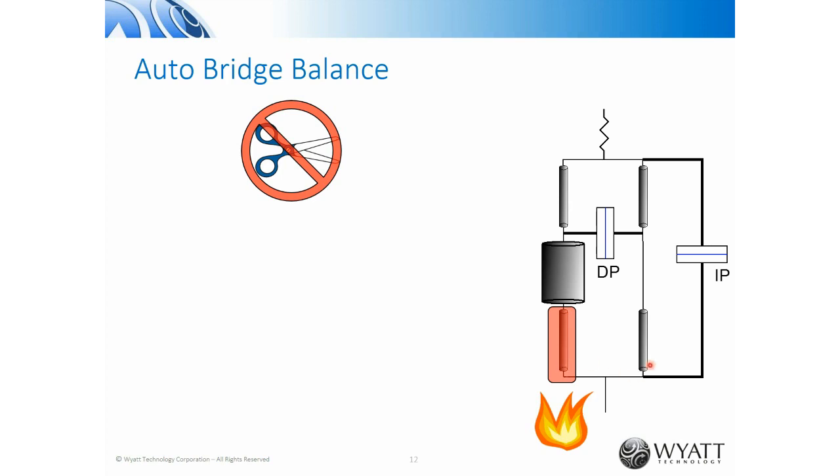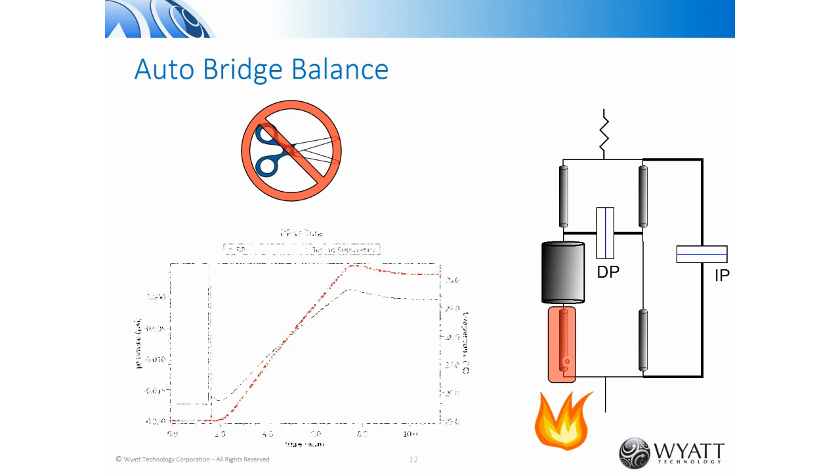And by adjusting this set point relative to these 3, we can automatically balance the bridge at any time by just pushing a button. And the nice thing about putting the thermal adjustment in this arm is that during the run, it only sees pure solvent coming through here. The sample does eventually go through here after the run is over, but during the run, you only have pure solvent. So if you increase the temperature of this arm by 1 degree relative to this, it reduces the viscosity of the solvent in this arm by 2%, and therefore it's the same as making this capillary effectively 2% shorter. So by adjusting temperature, you can effectively change its length, or the pressure drop in it.